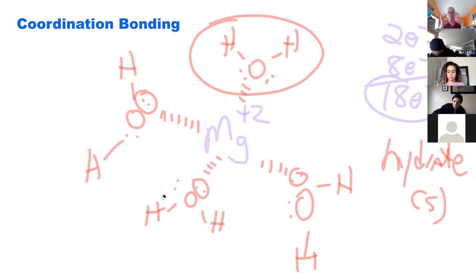So S brackets indicate solid. Well, if we add enough heat then the water will turn to a liquid, which we'll see in this experiment. You'll see the water go from a solid to a liquid to a gas.